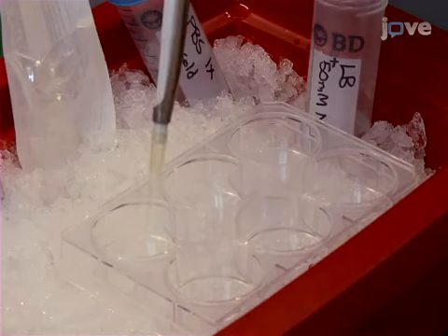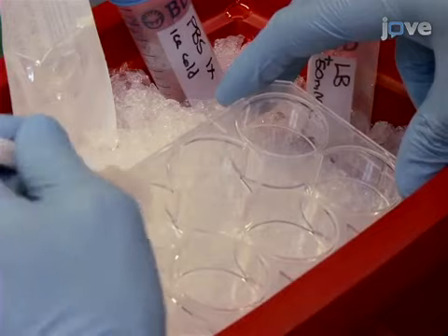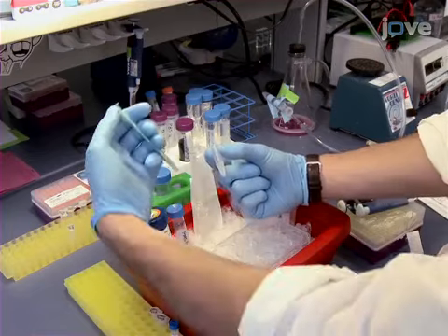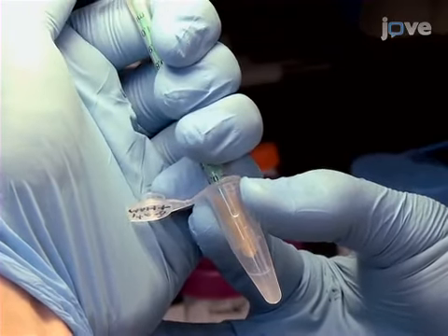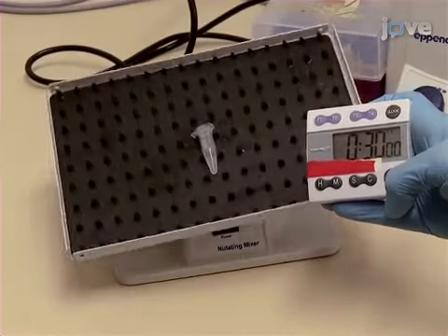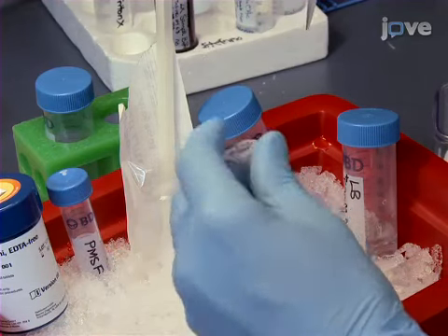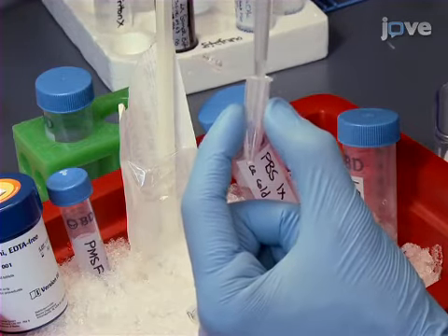Add 100 microliters of lysis buffer plus 50 millimolar NEM to the first well and repeat the well scraping process to collect any remaining cell lysate. Pass the total cell lysate through a 26½ gauge syringe 5 to 6 times to aid in mechanical lysis, being careful not to blow bubbles into the solution. Nutate the cell lysate for at least 30 minutes at 4 degrees Celsius. Following centrifugation, collect the cleared cell lysate in a new, pre-cooled 1.5 milliliter tube on ice. Repeat the demonstrated harvest protocol for all groups of cells.